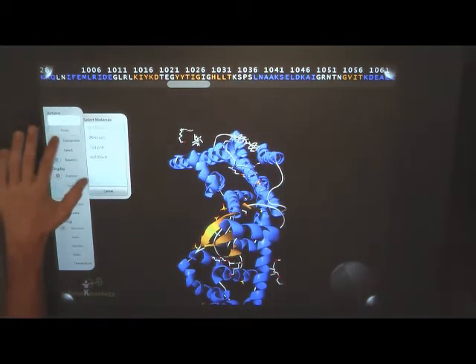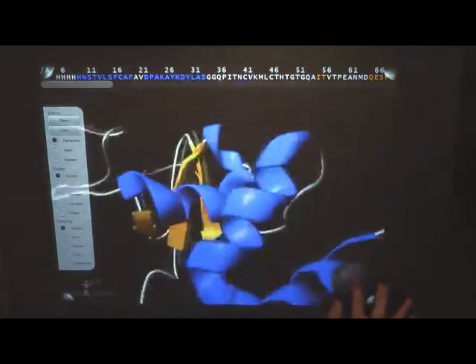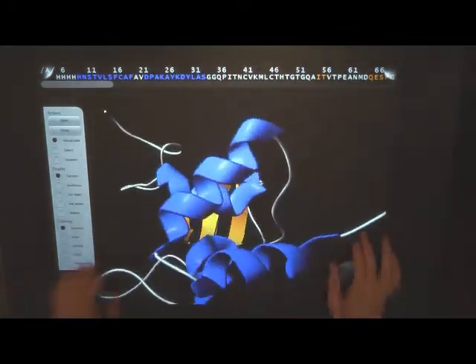Very nice. And we can take a quick look at this is a very large protein. This is a smaller one with a simpler geometry. Here the performance is even better. And it's Surface, so you could be rotating while I'm spinning, you know, because it's multi-user input. That's one of the beautiful things about Surface.